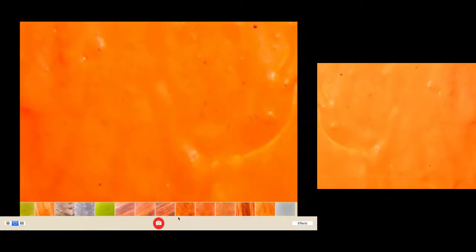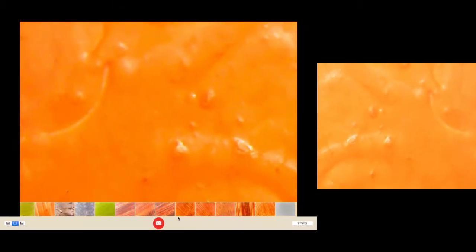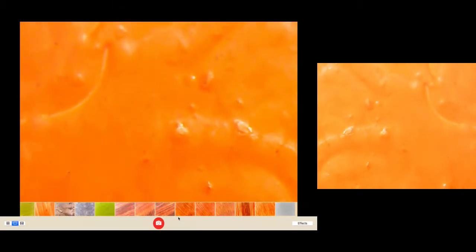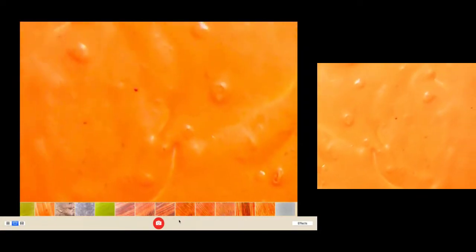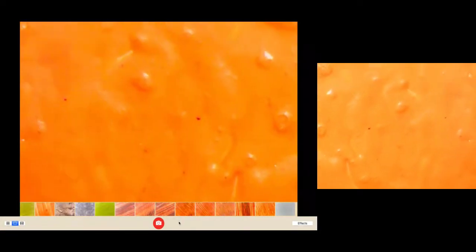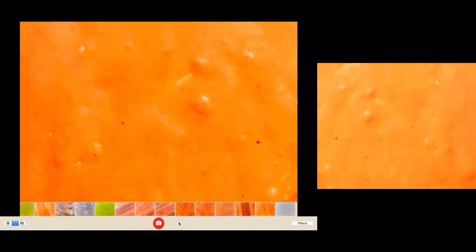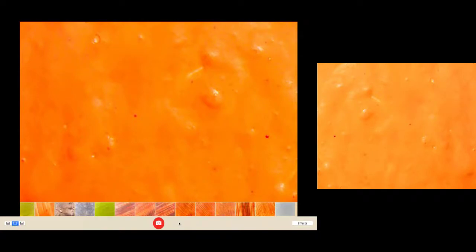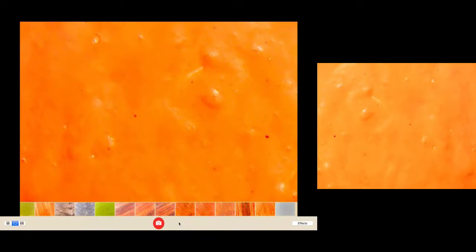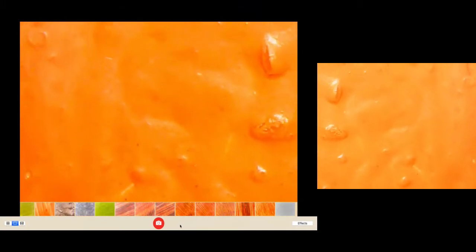Here's another sample we'll look at. Now this one has had the Aquazol applied to the surface. And that provides some degree of reflectance. You can see how the surface has been modified by applying this varnish. And definitely, definitely different quality to it.